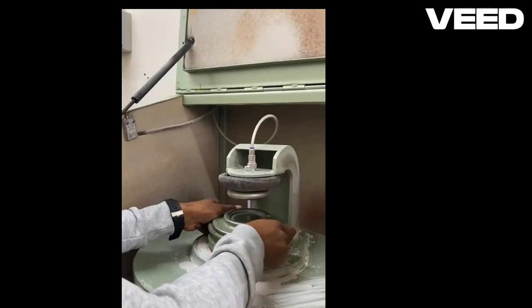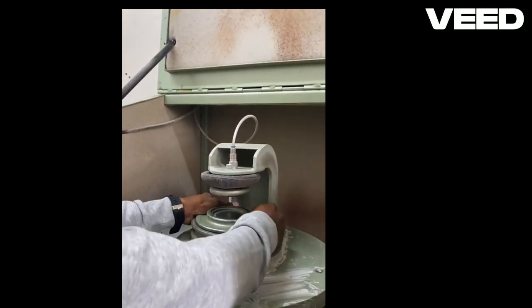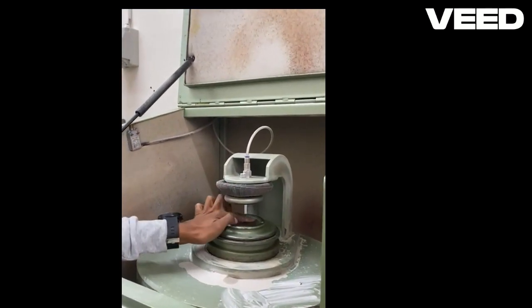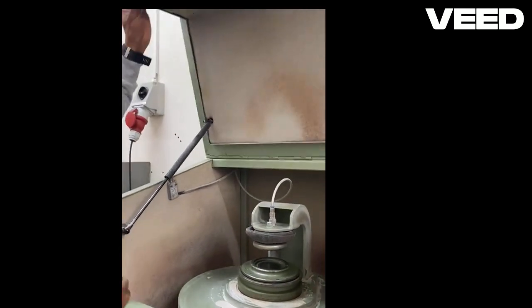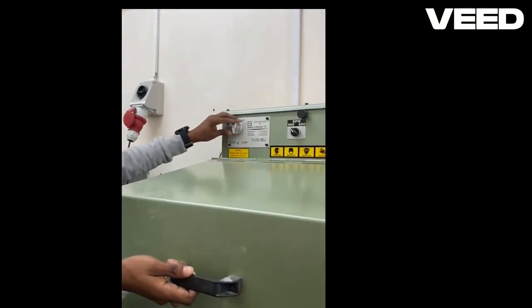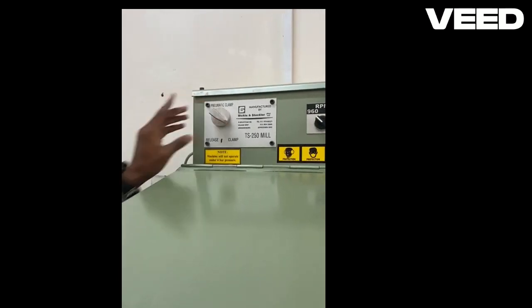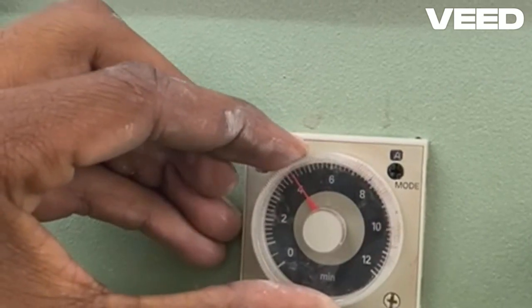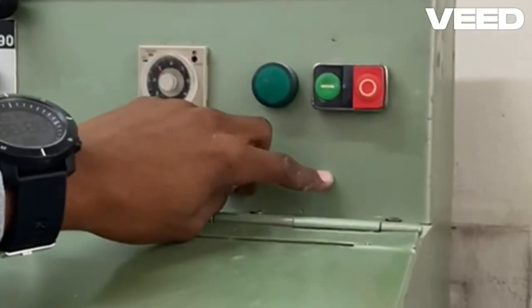Once the sample is loaded into the grinding ring, the puck is rotated at high speed, typically several hundred RPM, while simultaneously applying downward pressure on the sample. The rotating puck exerts crushing and grinding forces on the sample as it moves across the bottom of the grinding ring. This action effectively crushes and grinds the sample against the stationary grinding ring, reducing it to fine particles or powders. After placing the ring pod, turn the knob into clamp side to ensure there is a pressure applied.